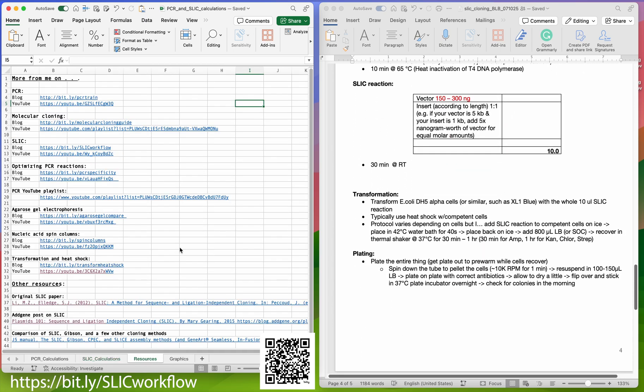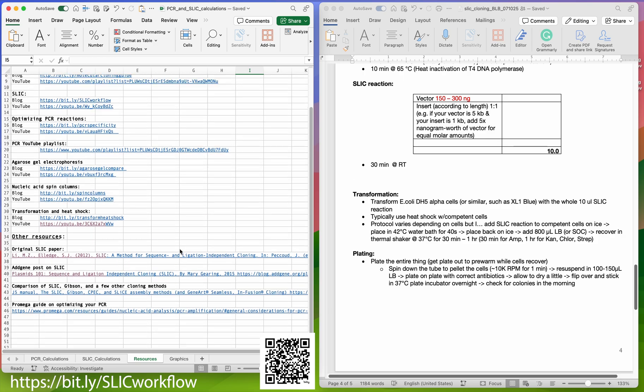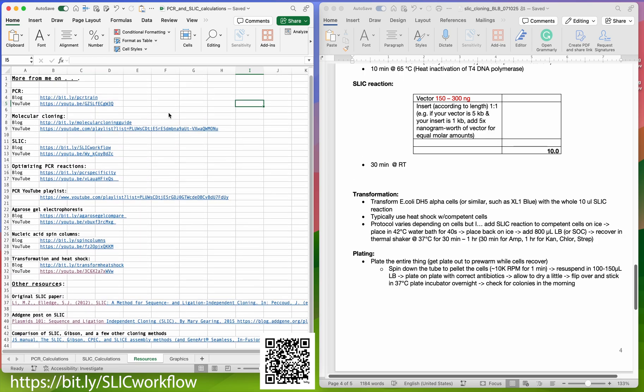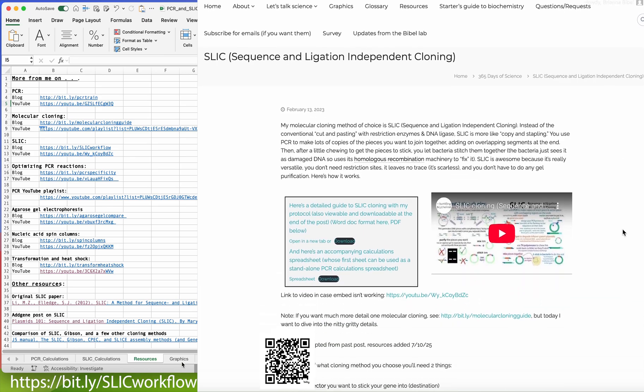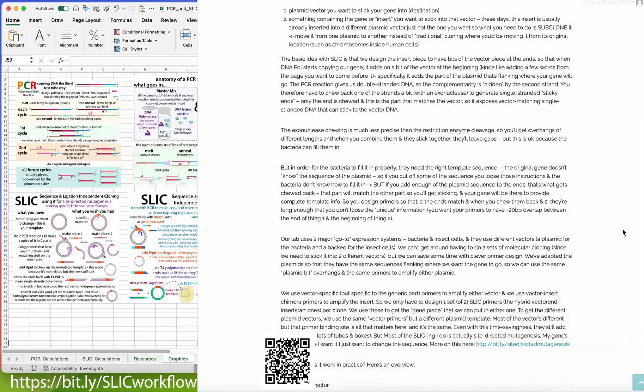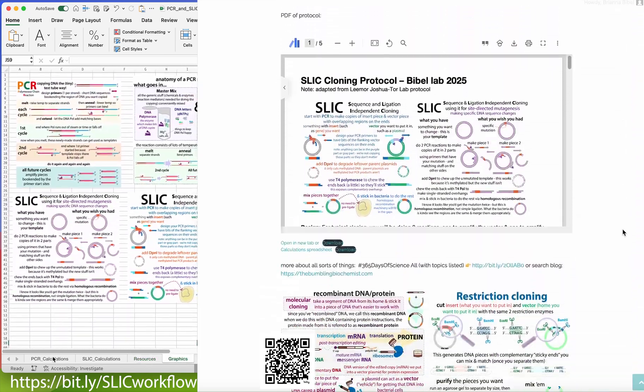I also have a page with links to lots more resources, including a blog post that accompanies the SLIC, and a video for the SLIC, and then I have some graphics here.